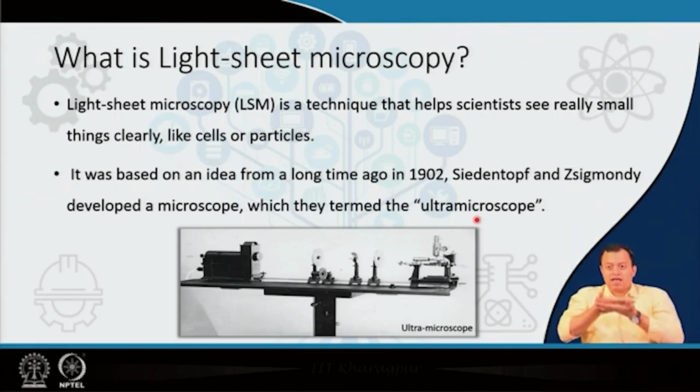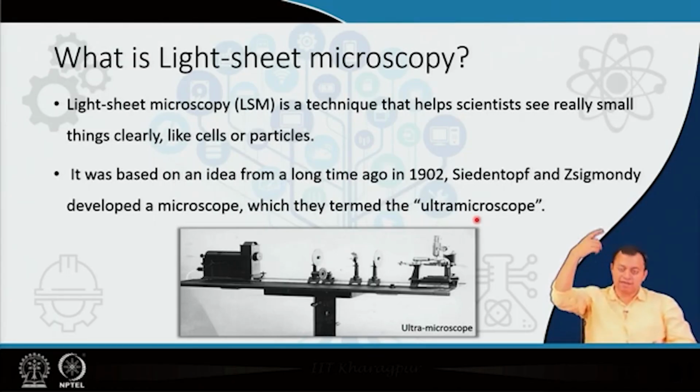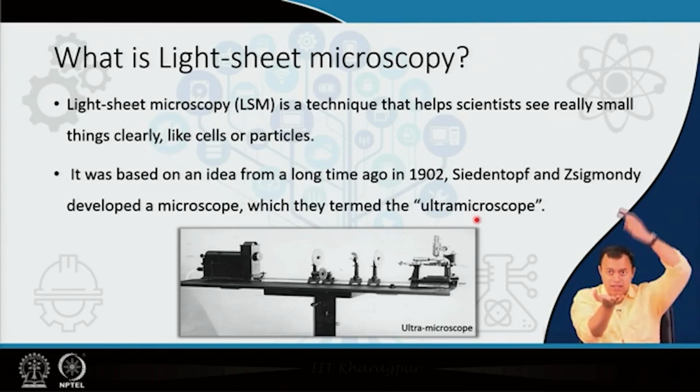Usually what we have in a reflection microscope is that light comes, falls and returns back. So, the entry and the output path are exactly the same. You capture the same light and then you try to analyze it, as in a normal reflection microscope. In a transmission microscope, light falls into a sample, it penetrates through it, it transmits through it, and you have your detector below and you are trying to measure it. Here it is 180 degrees, while in this case light is falling and you are measuring it from an orthogonal position.